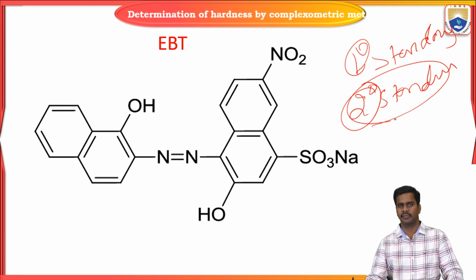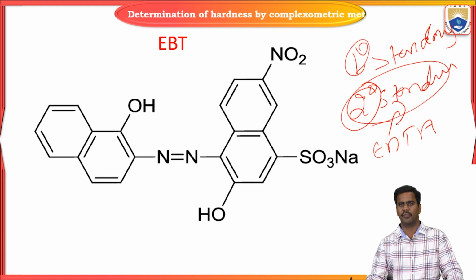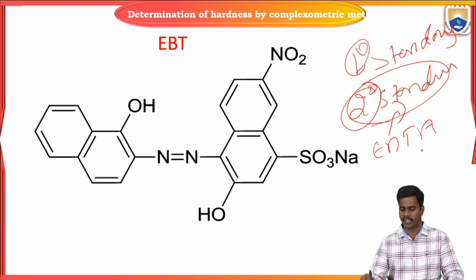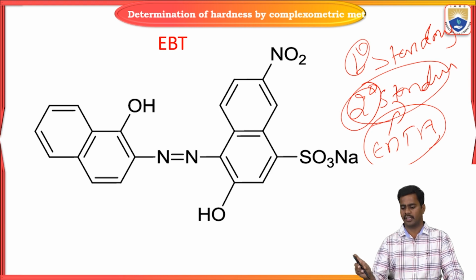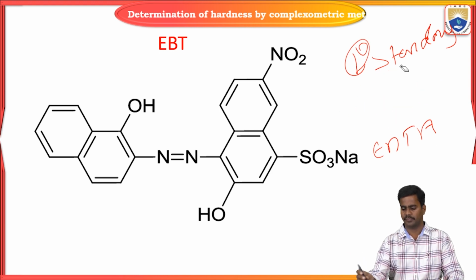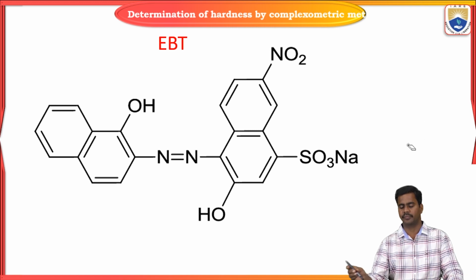Here, our EDTA belongs to the type of secondary standard. That's why, before going to the titration method, first we have to standardize EDTA. Let us see the standardization of EDTA.